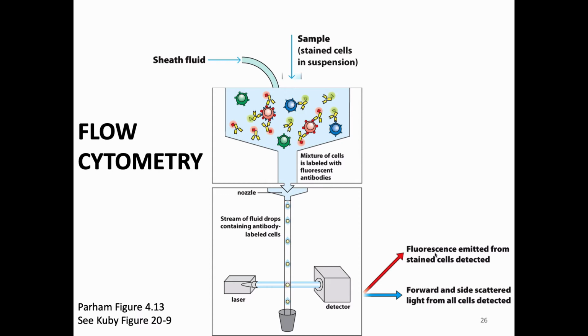You then can, with your settings on the machine, manipulate the way that the cells come out of this large area so that they are coming out in 1 cell per droplet of liquid. You do this, it depends a little bit on the type of machine that you have. This is depicting one that's dropping the cells by gravity flow. You do this largely by making sure you have a good single cell suspension and then playing with the pressure on the machine to alter the speed at which droplets are coming out.